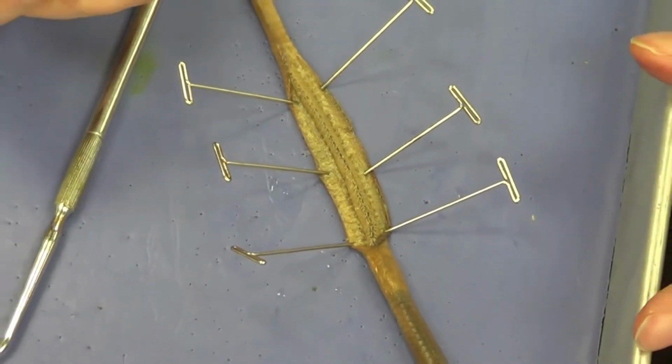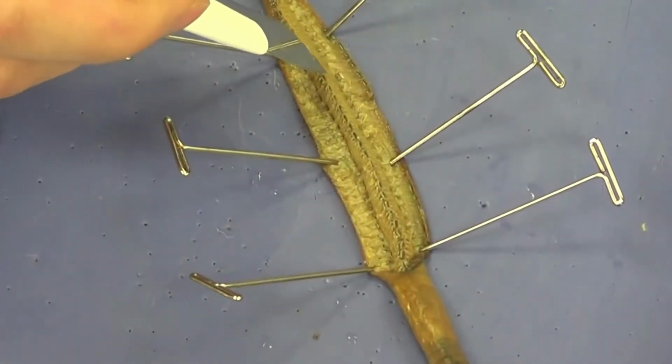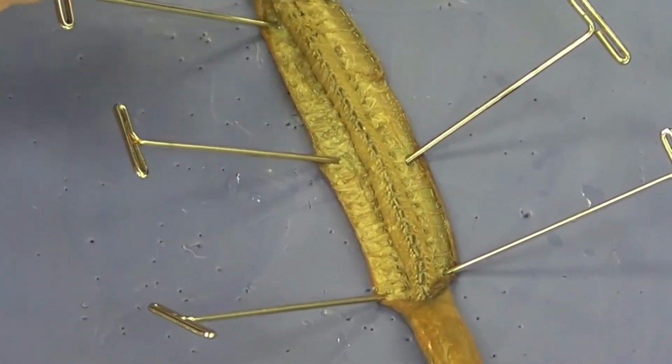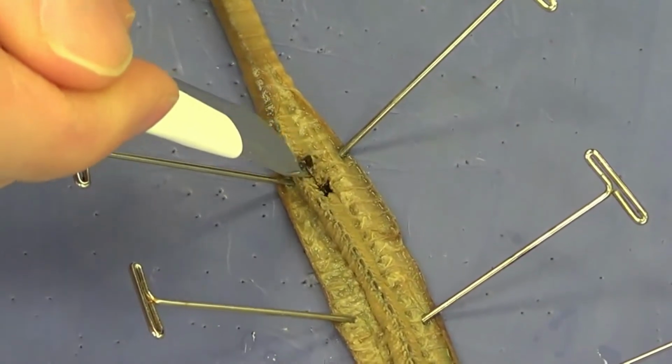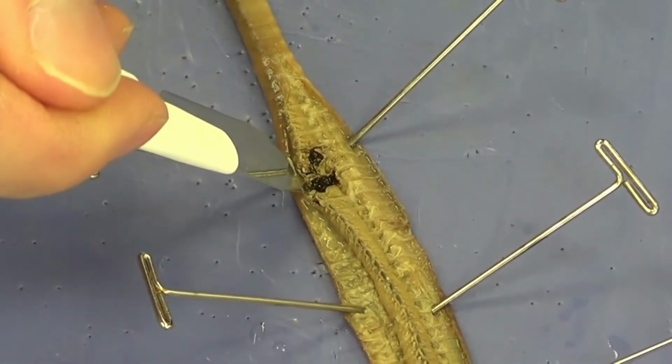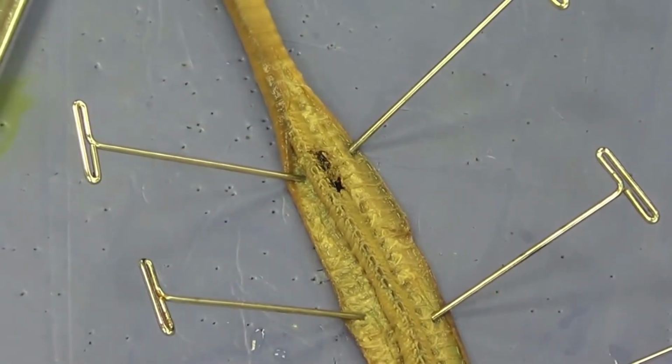Now, if you happen to cut too deep, I'm just going to go ahead and show you what's going to happen. I'm going to cut a little too deep here, and you can see the soil begin to ooze out. That's an indication that you have cut too deep. You need to back off and go a little bit more shallow.